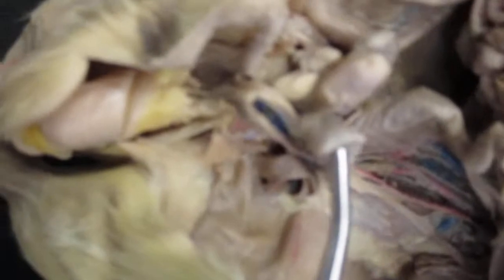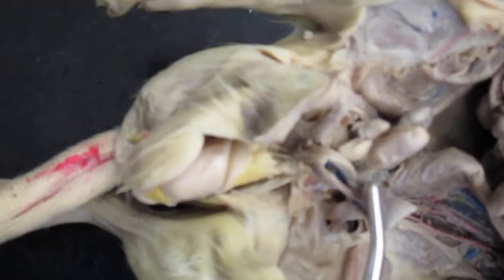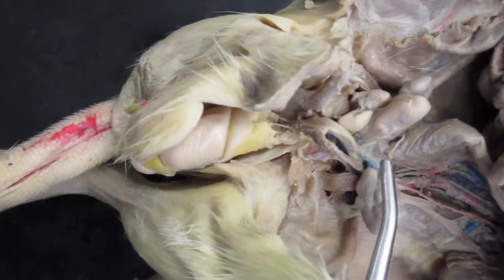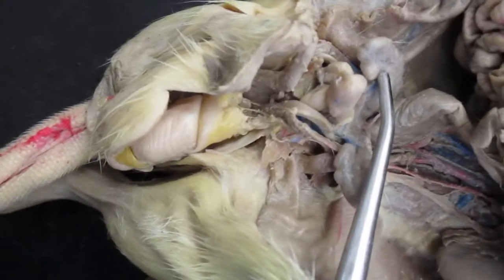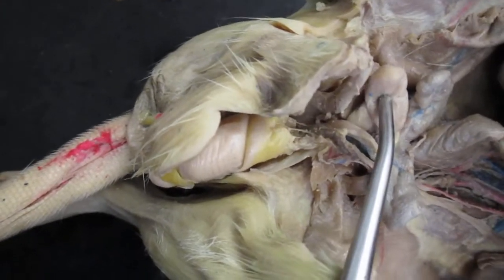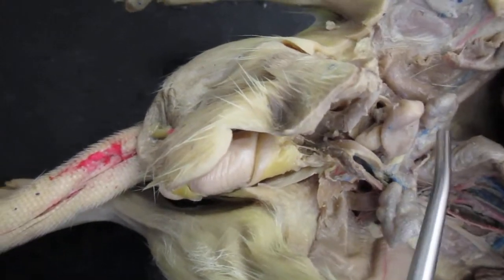Now, let's see what else. Oh, I want to show you these structures here while I'm here. These two structures here, which are sort of hard to see, there's two of them. You got this one here and this one here. Those are the seminal vesicles. Seminal vesicles here and here. This is the urinary bladder here. Seminal vesicles here and here.